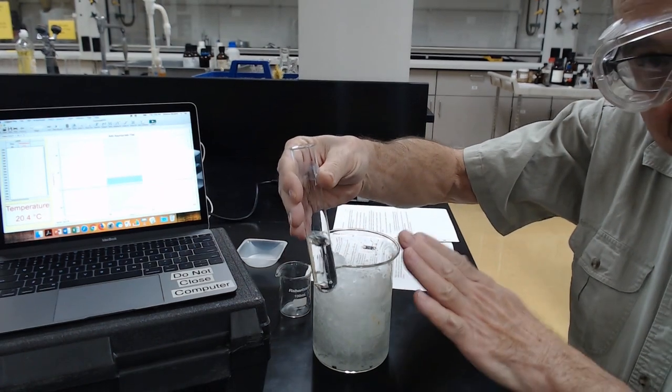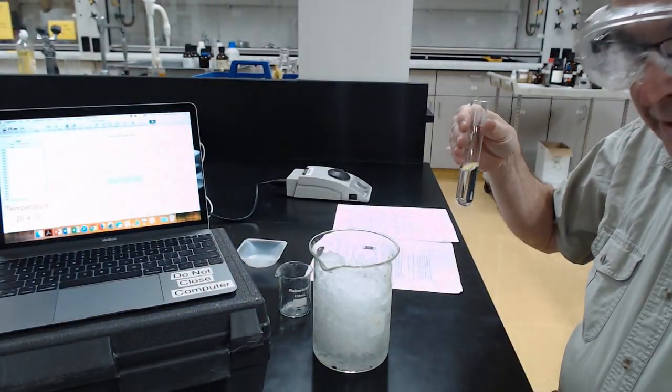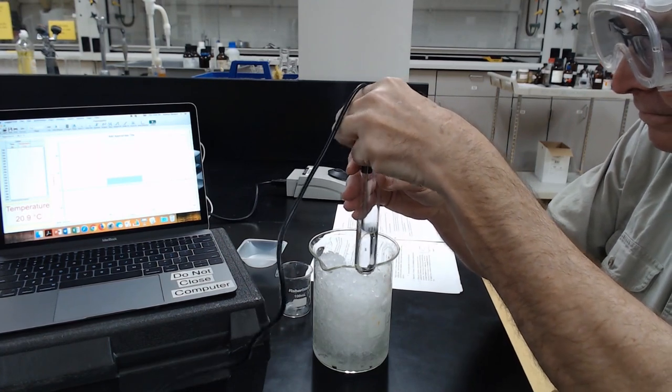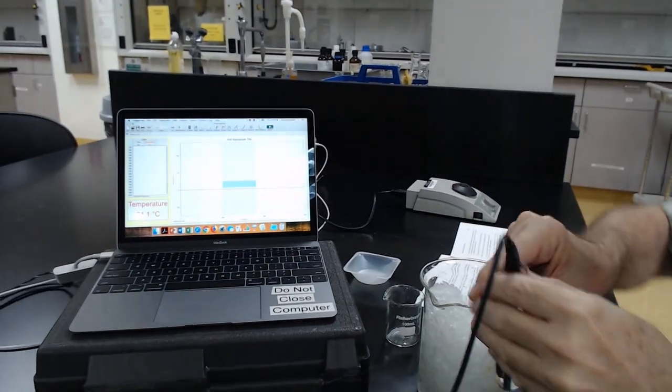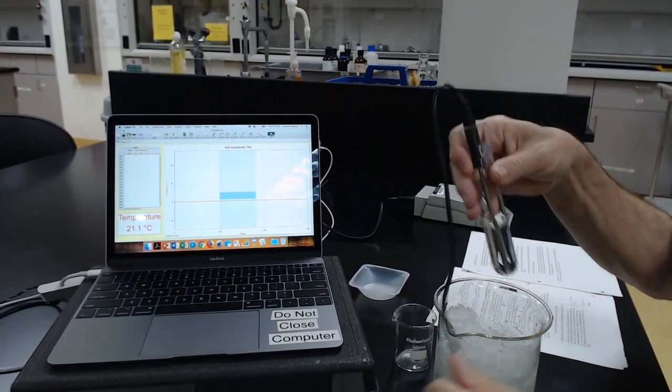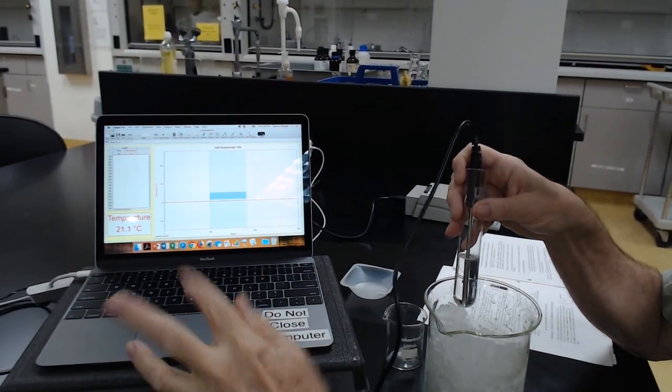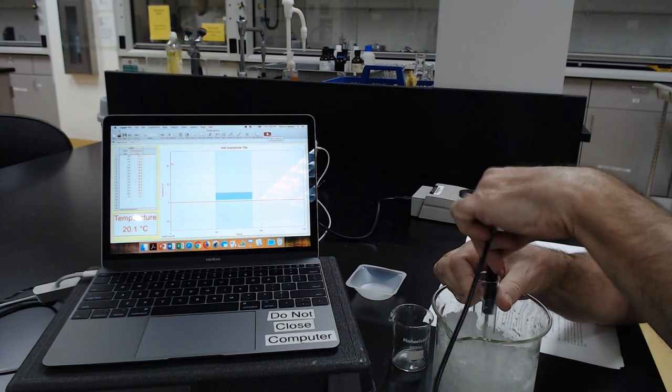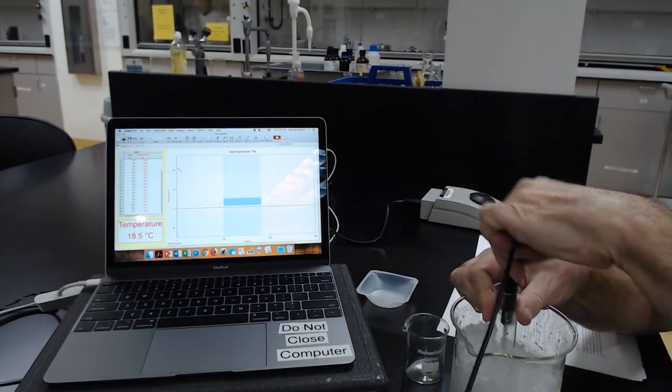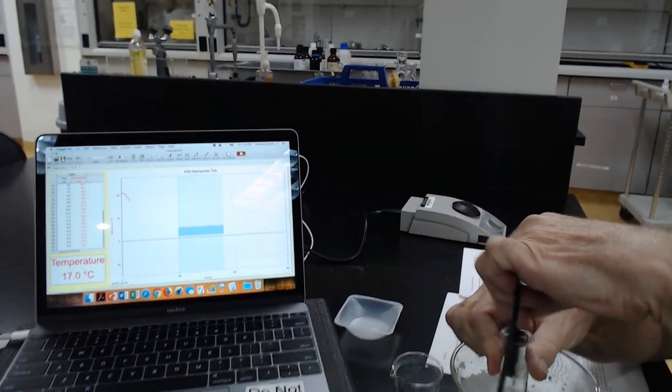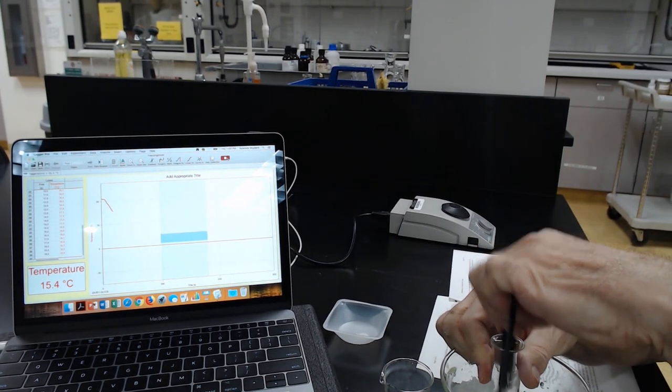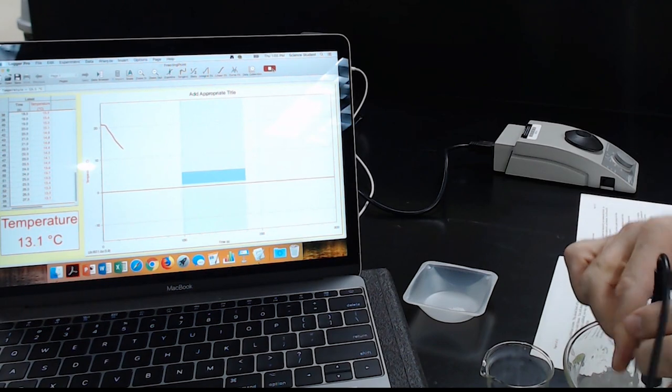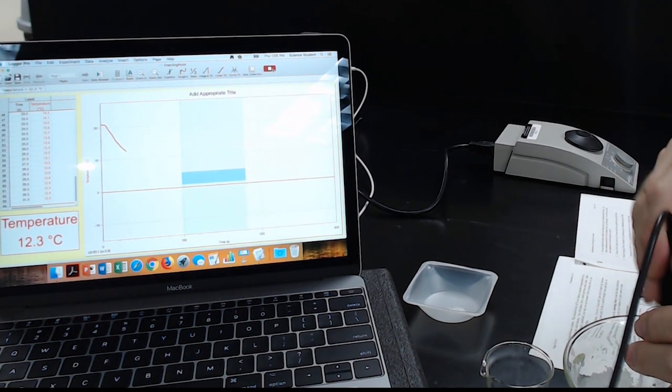So this mass of cyclohexane will be used twice. We're going to freeze it once. It's a pure material. Then we'll add the naphthalene to it and freeze it a second time. And the freezing point will be depressed. It will be lower than the first time. And then we'll have to repeat it for the second run, the cyclohexane naphthalene. Okay, we're ready to freeze the pure cyclohexane. And here's the computer all set up. It's connected to our thermometer here. And I'll put this in, bring it into equilibrium. There we go. So you can see the temperature here. And what I will do then is go ahead, plunge this in and start the computer at the same time. Like that. There we go. And I'll just keep stirring this.